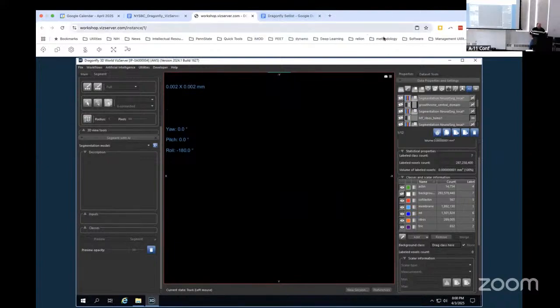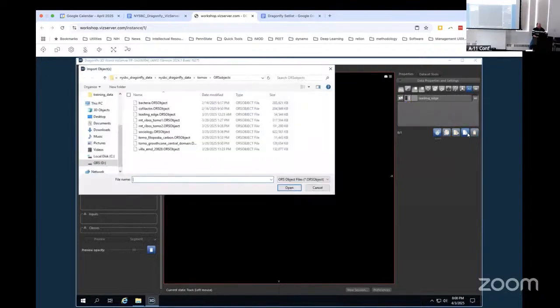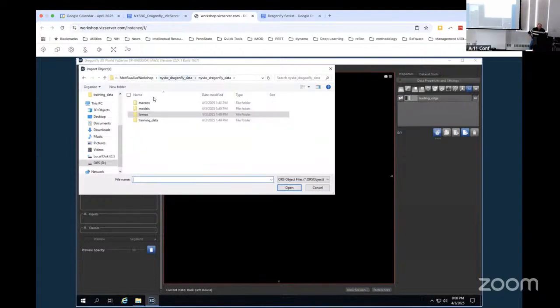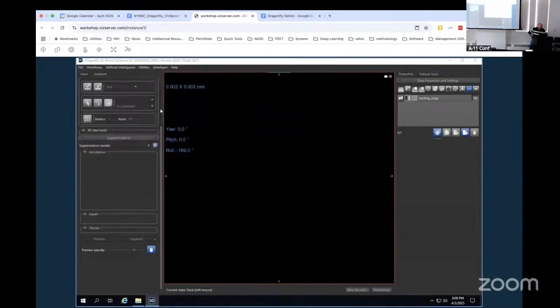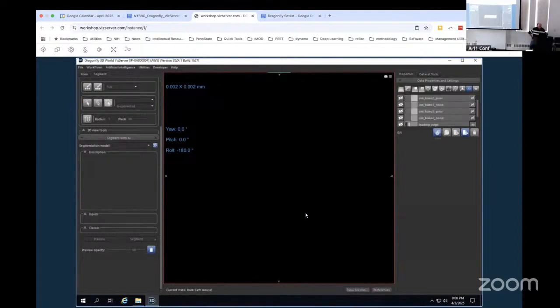So let's talk denoising for a minute. I keep hitting that button. All right. If you go back in and go into training data, there's something called denoise training data. And this will be at least a little bit different. We can look at how the ground truths compare.